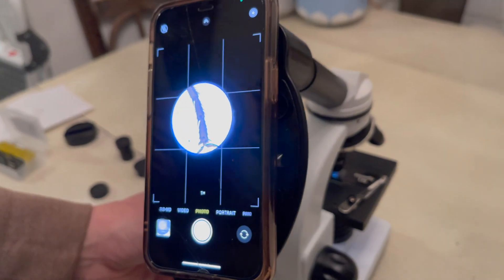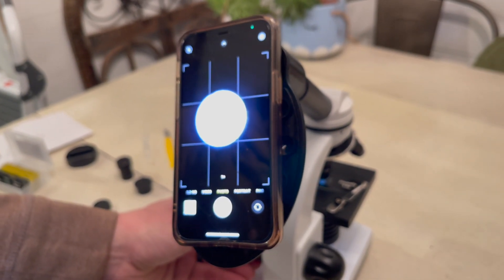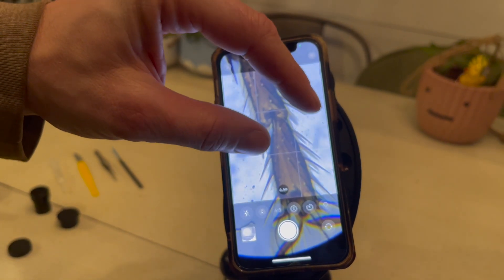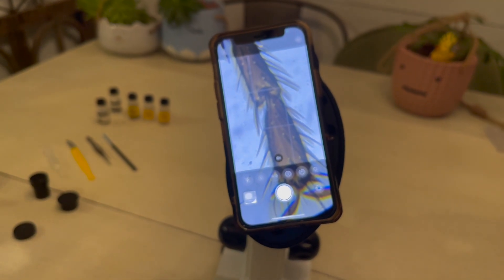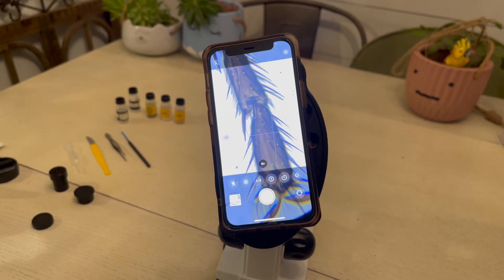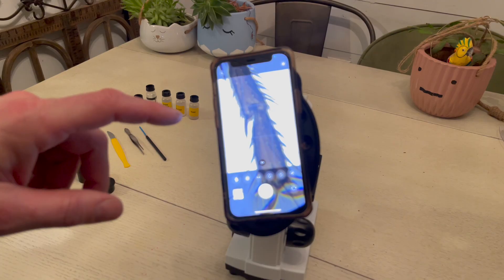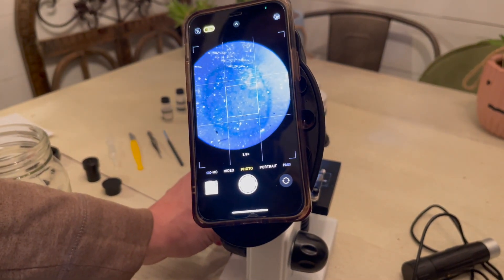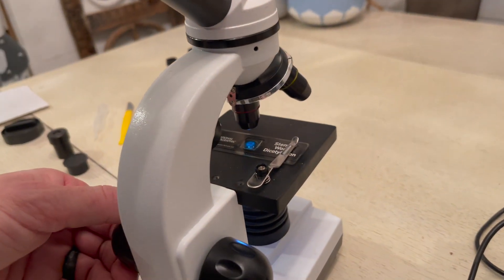There is a smartphone adapter included with the National Geographic microscope and I really think this is the best feature. It is so cool to put your phone on top of the microscope and look at what's on the slide — everyone in the room can see it at the same time. This is the fly leg included in one of the pre-packaged slides, and you can zoom in with your phone, record, take photos, and it's a really neat way of seeing everything from a completely different perspective.